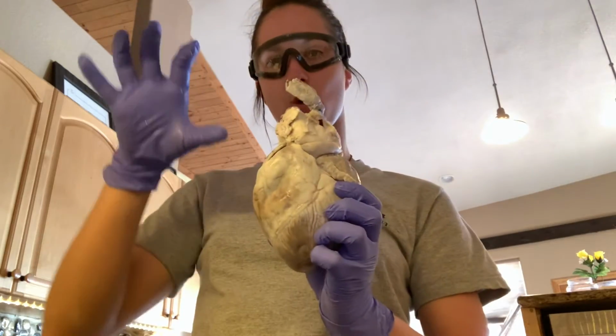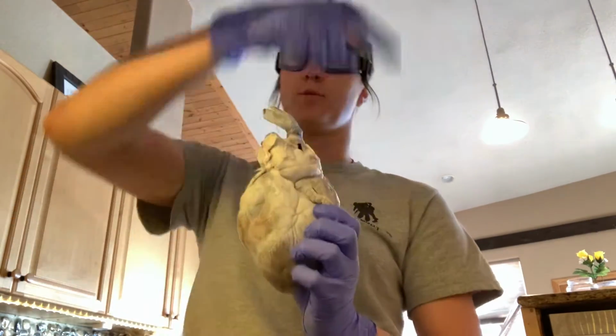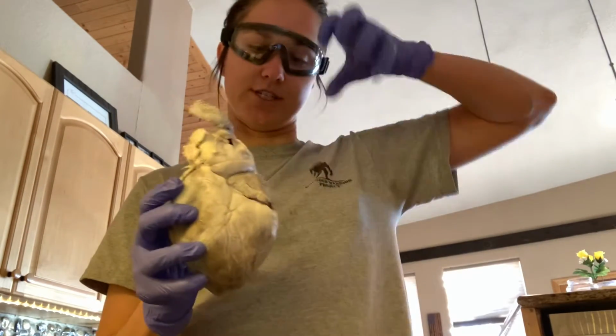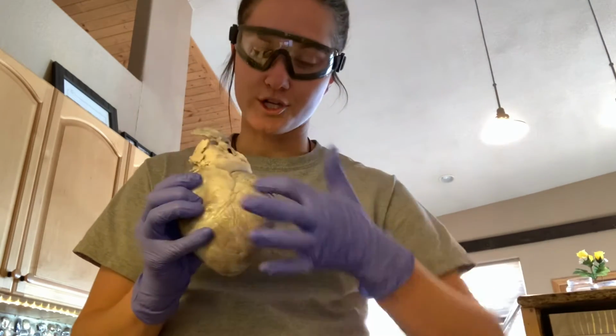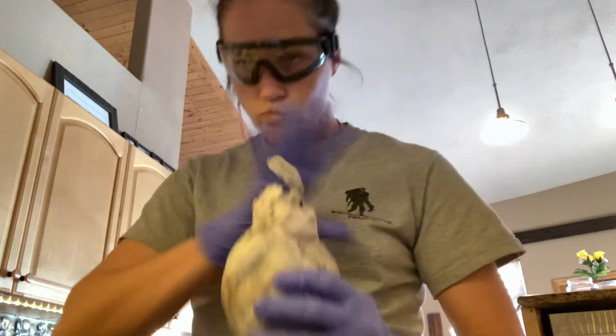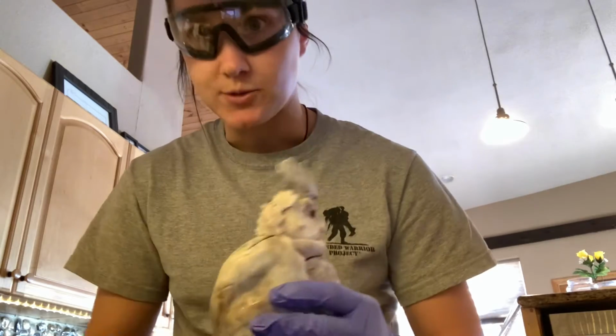This right upper quadrant from the outside, we have the right atrium, right ventricle, then we get the blood circulating through the lungs, come back into this left side, which is the left atrium, into the left ventricle, which actually takes up a bulk portion of the rest of the heart. And then it shoots the blood out through the aorta. So that's the outside. From the inside aspect, that's what we'll talk about next.